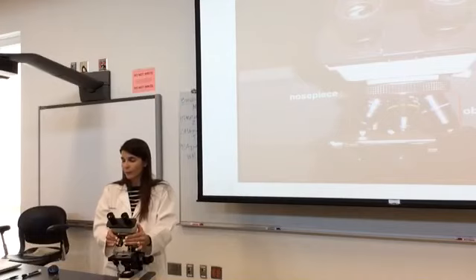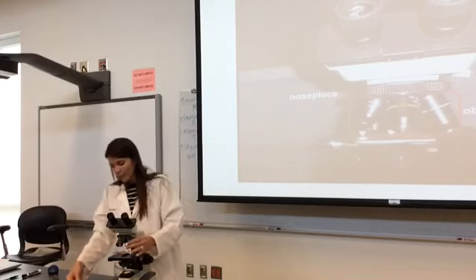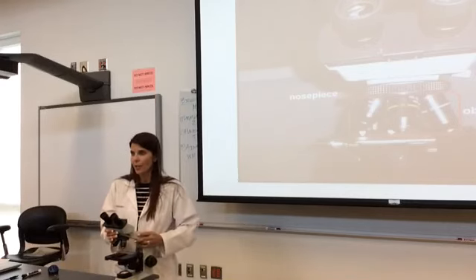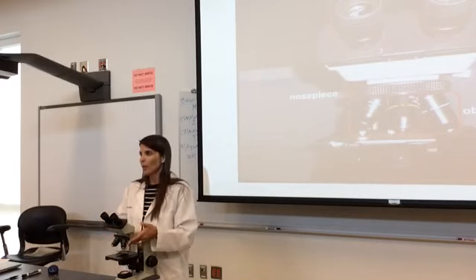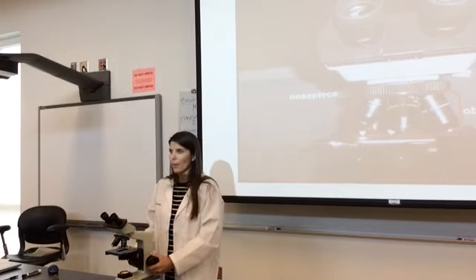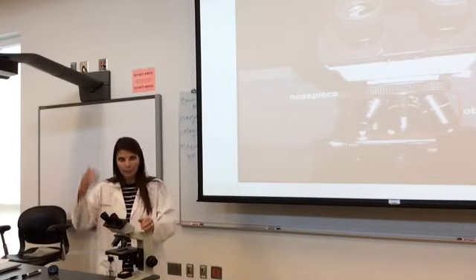All right? Now, I want you to please put your low power objective in, completely engaged. Completely engage your low power objective. So the red one is engaged. Once you do that, may you raise your stage all the way up using the coarse adjustment knob. Raise your stage all the way up.